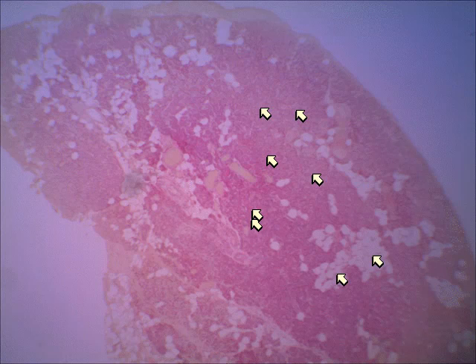And then you also see pockets of adipose cells. On this slide, it's really easy to recognize it's parathyroid to me because of the pockets of adipose, but you don't always see that. Another thing I want you to notice on this slide, if I erase the arrows, let's point to this area and this area. Don't these areas look quite a bit like those follicles we just saw? All right, these are pieces of thyroid follicles that are attached to the parathyroid gland.